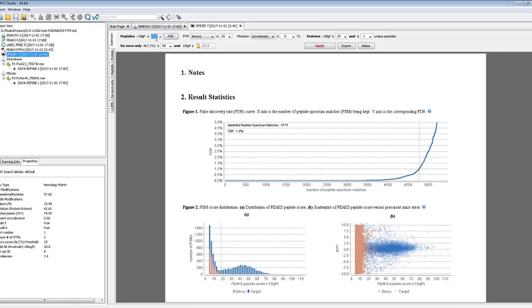And to talk a little bit about the other filters that you can set here in the summary view, you can set a PTM filter. So you can either select an A score or ion intensity. Some recommended parameters there: for the A score, we usually recommend a cutoff of 20 or greater.